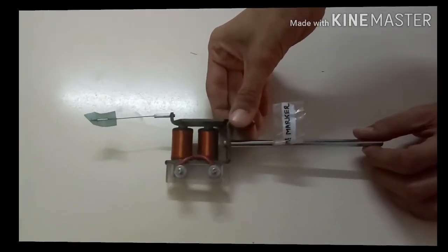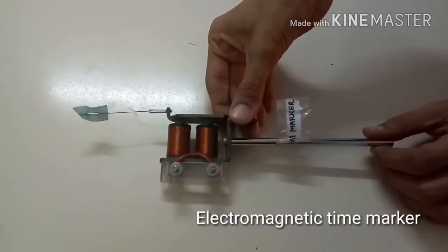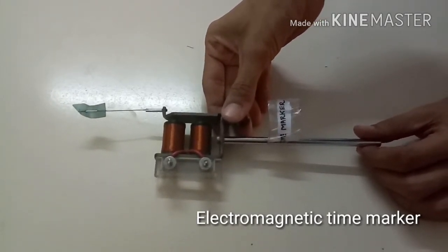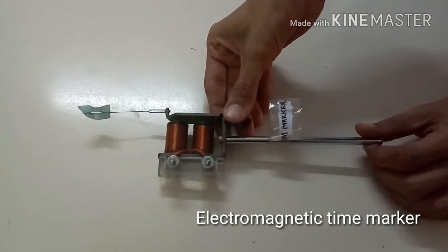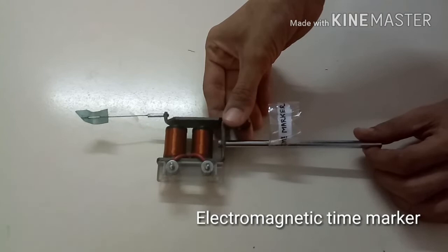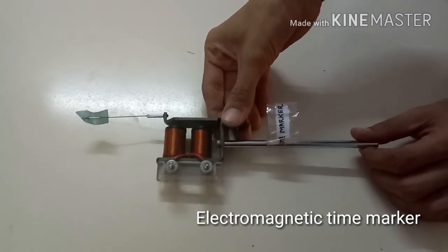Next is Electromagnetic Time Marker. It is used to mark time in cardiac experiments. It is used along with the central low voltage unit and can provide make-break contacts at intervals.